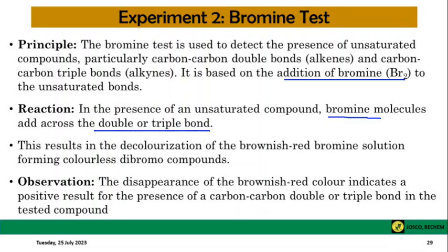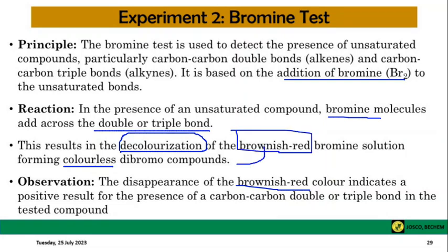When that happens, there will be a color change from brownish red to colorless, which is what we call decolorization. I hope you get the whole idea of this test.